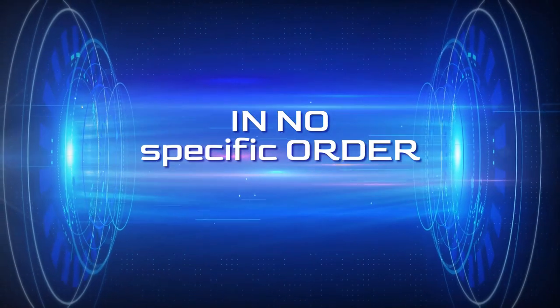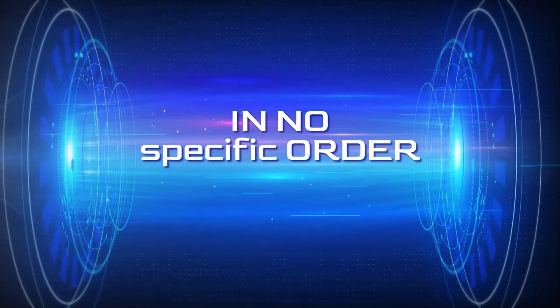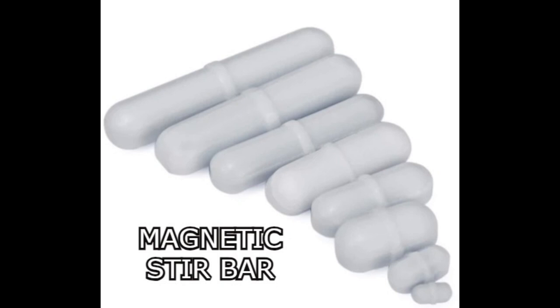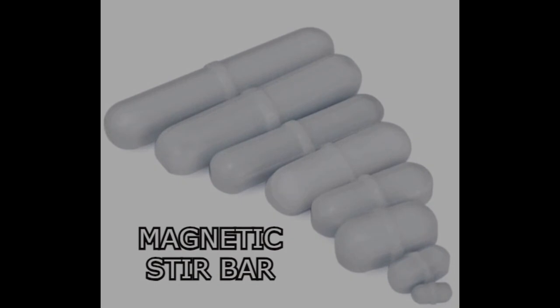But no specific order. An Erlenmeyer flask. I choose a 300ml one. A magnetic stir bar used in the flask and the stir plate produce a vortex. All will become apparent later on.